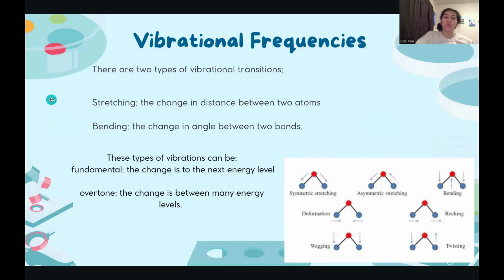So when a molecule absorbs a packet of energy, it undergoes a physical transition. It moves from a lower to a higher energy state. Once the molecule is in that excited state, the energy manifests as a continuous vibrational motion. The atoms move back and forth relative to each other at a characteristic frequency caused by IR radiation. So molecular vibrations aren't the transitions, but rather an option that's available to a molecule to do something with that packet of energy it's been given.